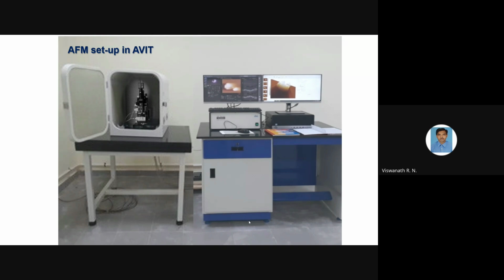In the electron microscope, we are using an electron beam, and the electron beam is either transmitted or scanned at the surface. If it is scanning at the surface, then we call it a scanning electron microscope. If it is transmitted and we get the information from the atomic arrangement, then we call it a transmission electron microscope.